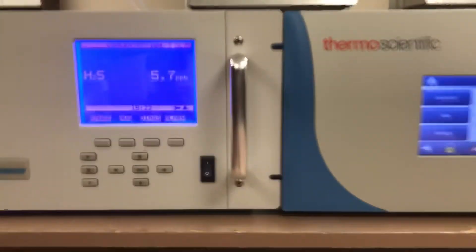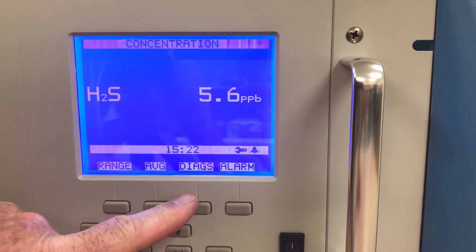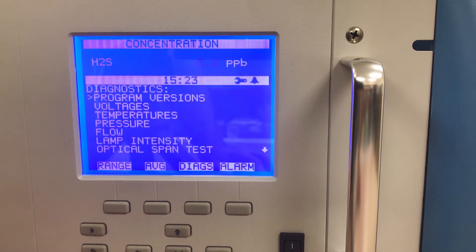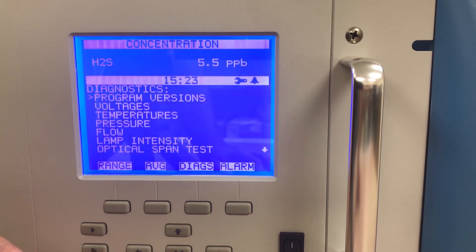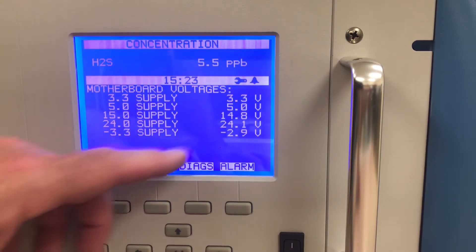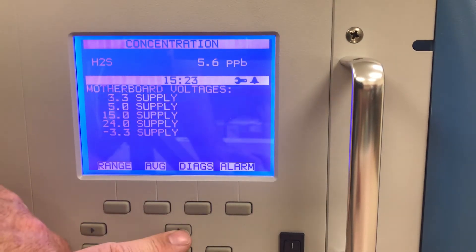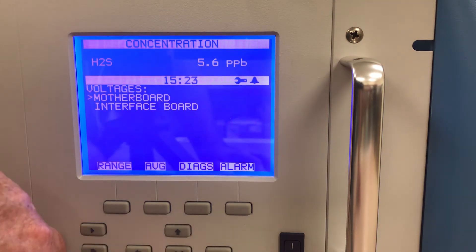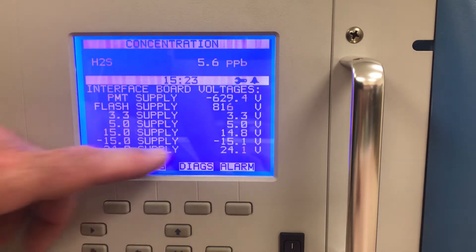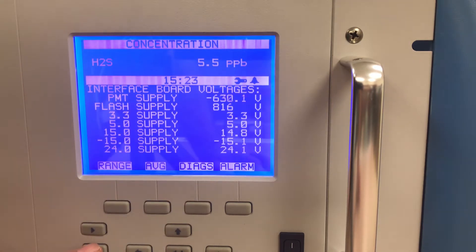On the I-Series, I use the diagnostics menu. If I'm doing maintenance and don't have a station logbook — I don't know when the pump was replaced or the pump repair kit was changed — I'll look at the diagnostics menu and go into voltages, motherboard, and interface board to look at the set points on the left and what they're actually reading on the right. If they're pretty close, I'm happy with that. If they weren't okay, I would know I need to change the board soon before it fails.